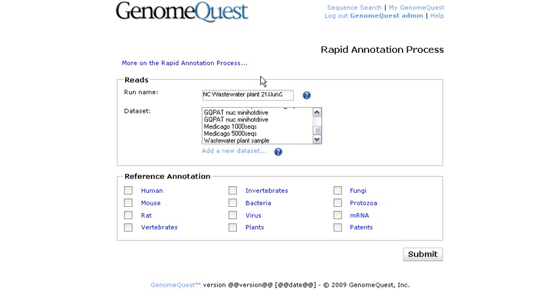Hi, I'm Laurent and I'm going to talk about the rapid annotation process in GenomeQuest. The applications of this workflow range from metagenomics experiments to the characterization of new pathogens, bacteria or viruses for example, starting from 454 or Sanger sequencing reads.